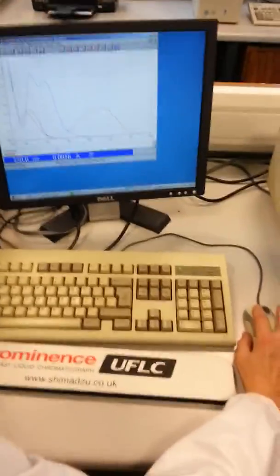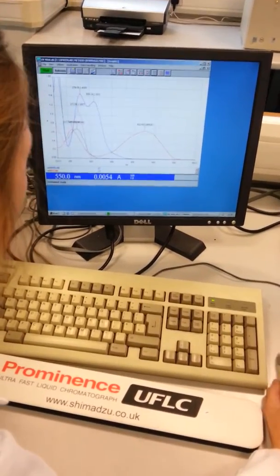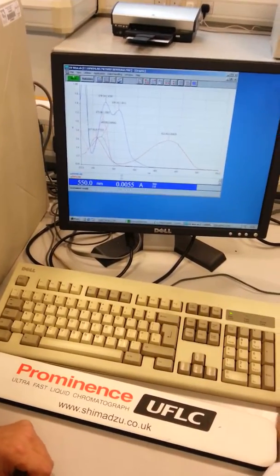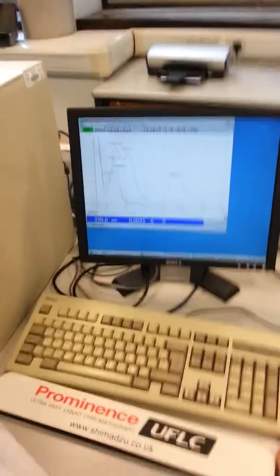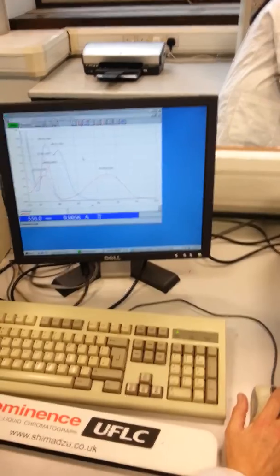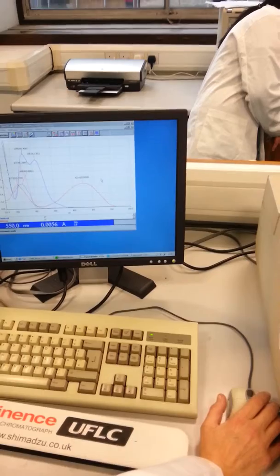Right, okay, so now I'll label. It's pretty similar. Yeah, it was quite like this graph, didn't it? Okay, and then we want 3 copies. Yes, please. So is this a perfect example of what we should have got? Looks pretty close, yeah. This one looks pretty similar actually. Oh, I've done alright actually. It was done by me, so it won't be perfect, but it should be close to it. Yeah, that's good enough.